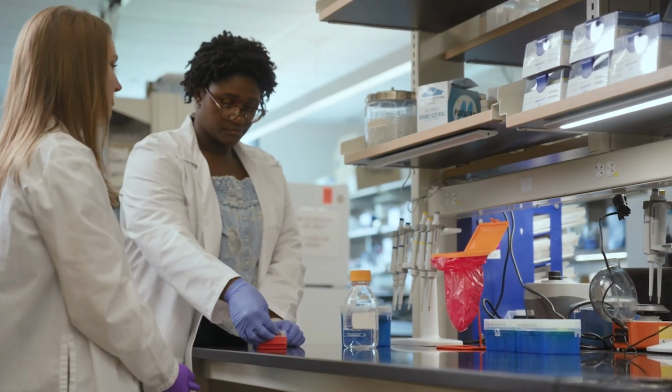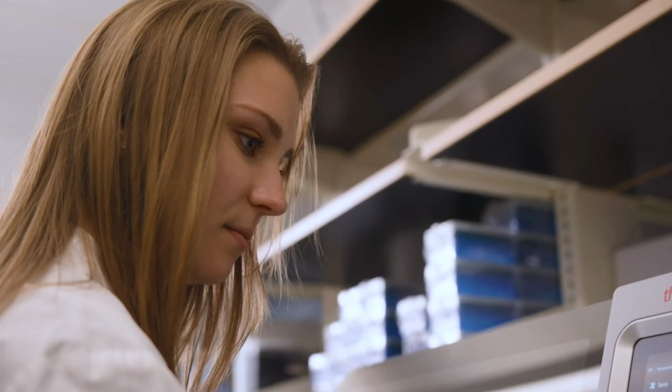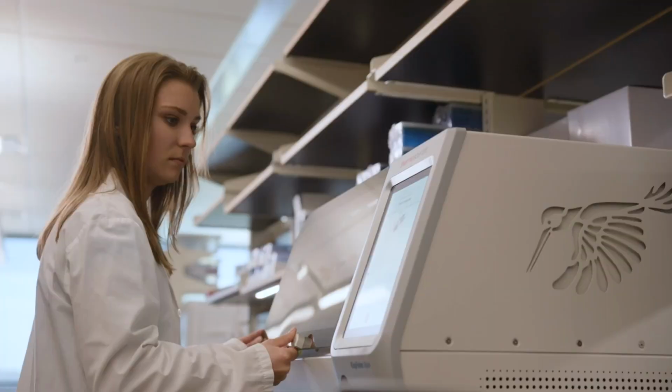And so we took a series of isolated T cells and tried to see how good we could make measurements using gas phase fractionation for library generation, as well as trying to do our targeted experiments on as low input as possible. And our focus with this was trying to see, within a matrix matched calibration curve, how low we could actually make quantitative measurements for these particular peptides using transitions that we've refined using our software platform. And so we started within a background of 100 nanograms. How low could we measure our key proteins of interest?